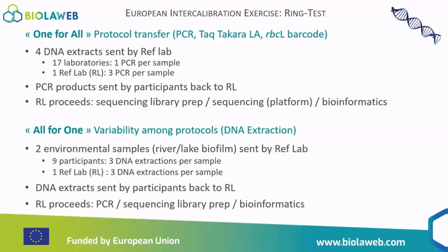The other strategy was the all-for-one. That means everybody uses his favorite protocol, and tries to analyze the same samples to see if there are big variations among protocols and among labs and so on. And I will present that for DNA extraction.